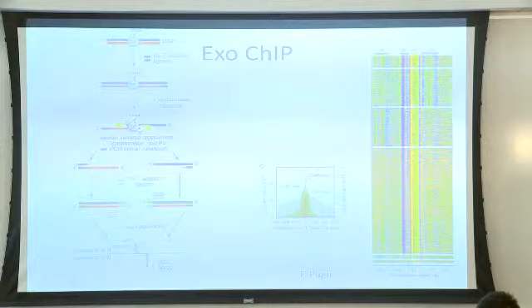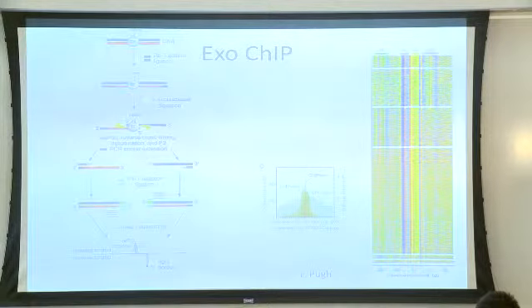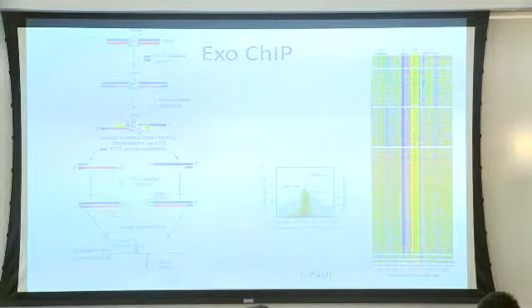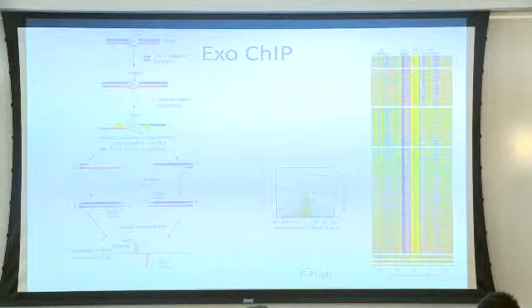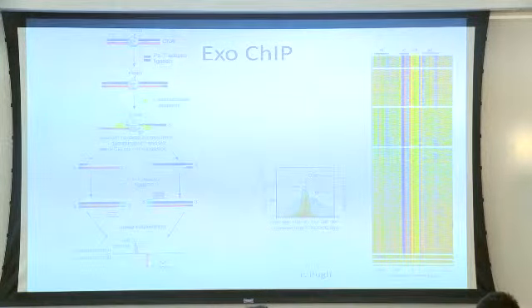Okay, and then the DNA is recovered from this, and the crosslinks are reversed, and then it's very important that it's also denatured, meaning that if there remains any additional residual annealing between these two strands, the denaturation step eliminates that annealing.